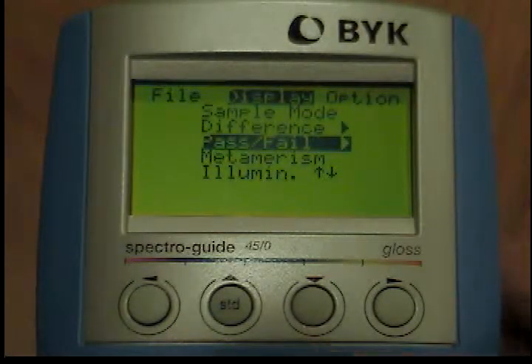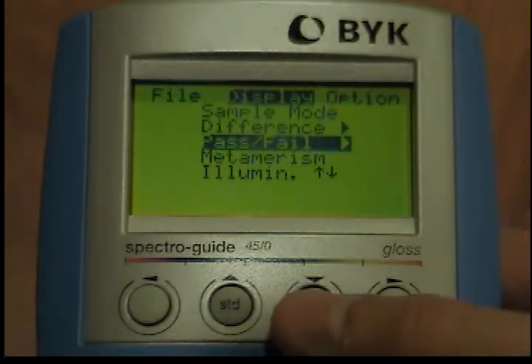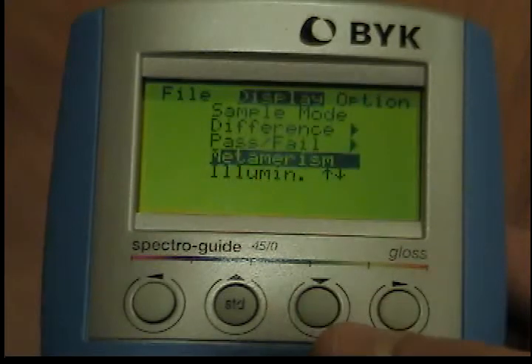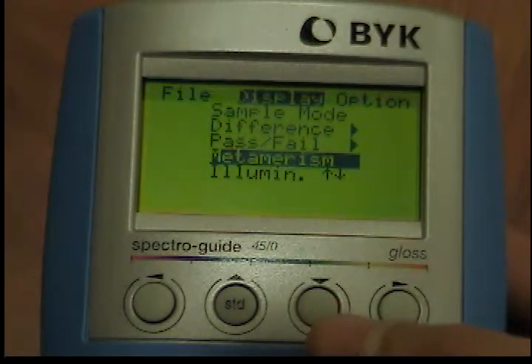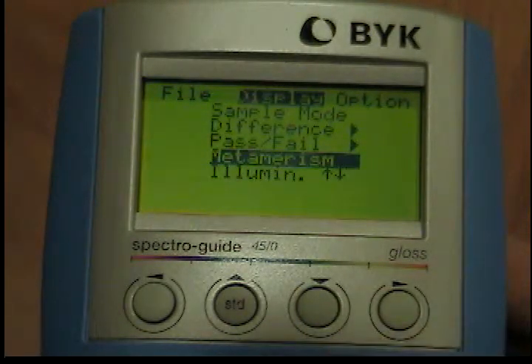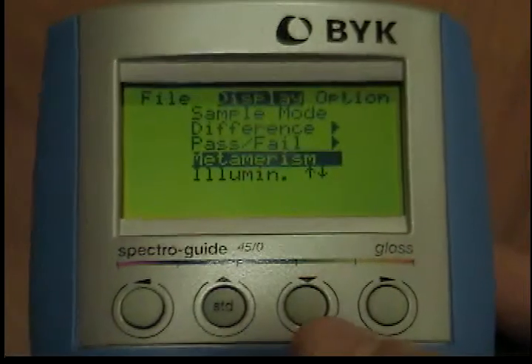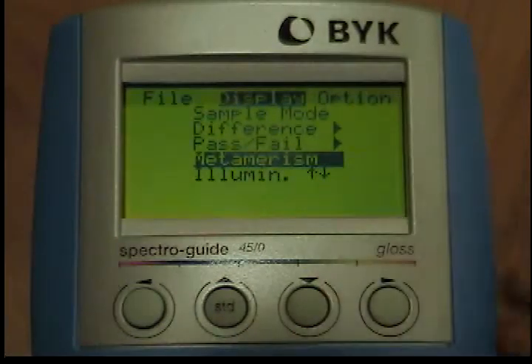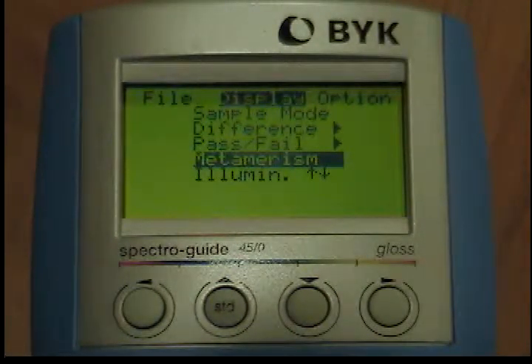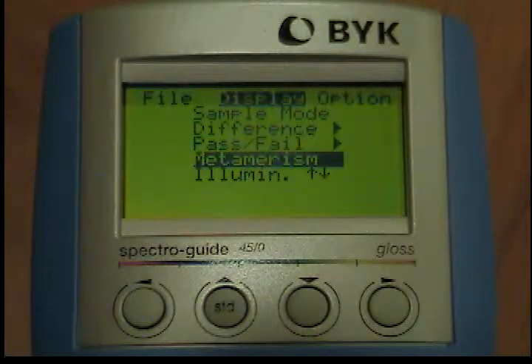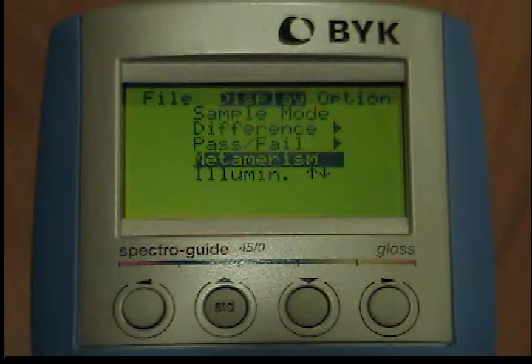Metamerism. If the metamerism index is set to unequal to zero in setup, the metamerism index will be calculated for each measurement. If it is greater than the value selected in setup, this will be indicated by a reversed M in the bottom line of the display. However, this is only true in difference and pass/fail modes.